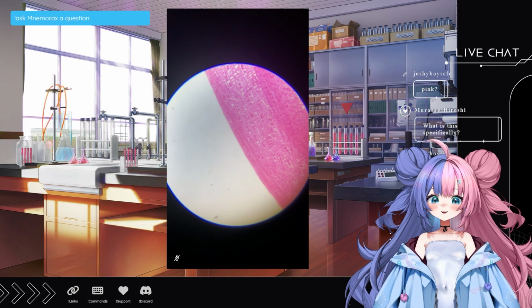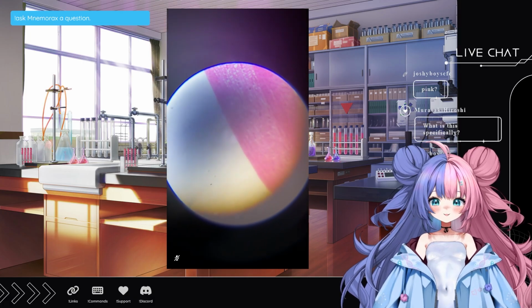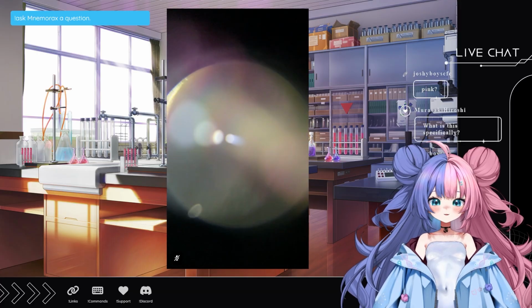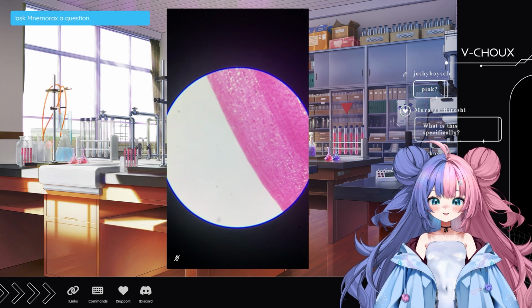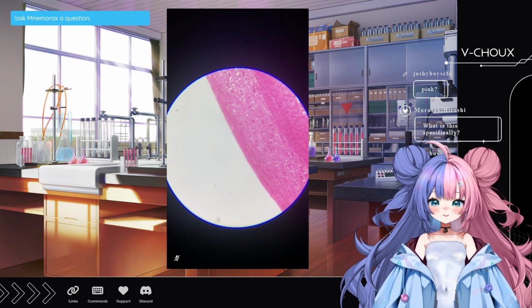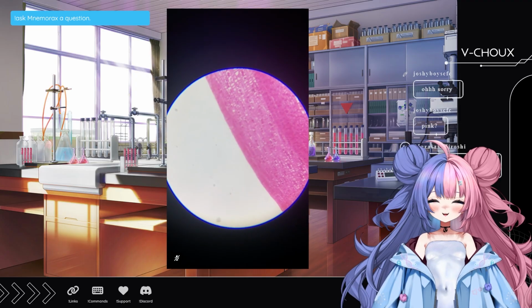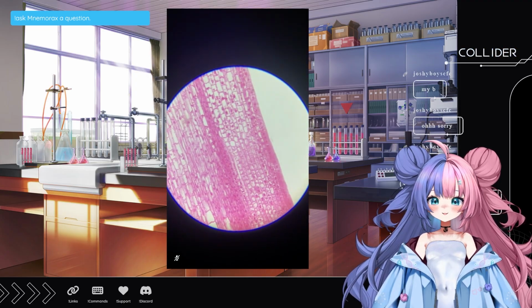Now, you see how small they are? Oh, guys! The colors you see are not the ones from the actual plants. They are the tint you use in the lab in order to make the sample more visible or clearer.